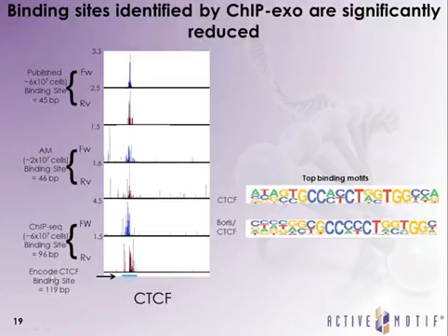And when you turn on the ENCODE database, if you're using Genome Browser and run the ENCODE database, this exact same binding site for CTCF is identified to be 119 base pairs. So as you can see, ChIP-Exo has much better resolution, by about 2 times, than what you see with the ENCODE database. Data generated from this ChIP-Exo experiment were run through Homer to identify exactly what binding sites we were identifying using ChIP-Exo, and the top 2 binding sites were both CTCF binding sites, as you can see here.